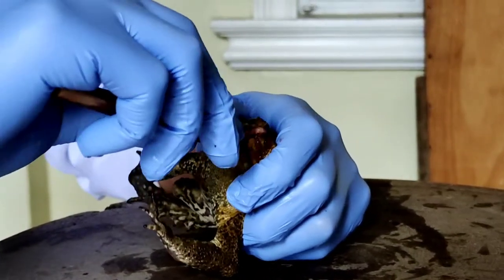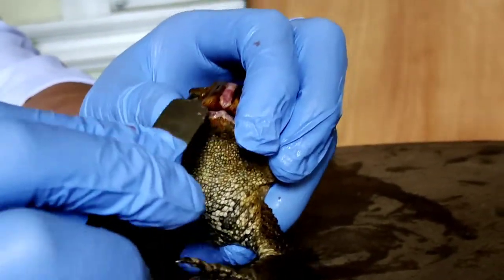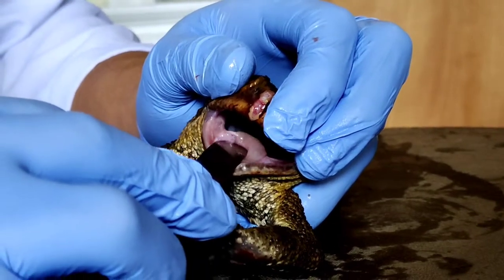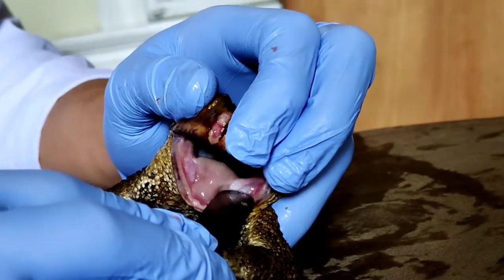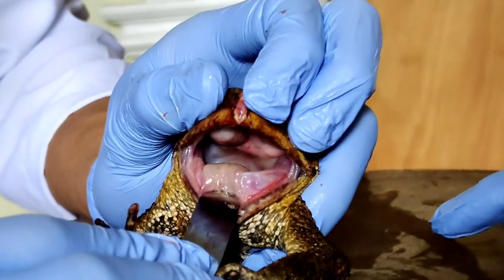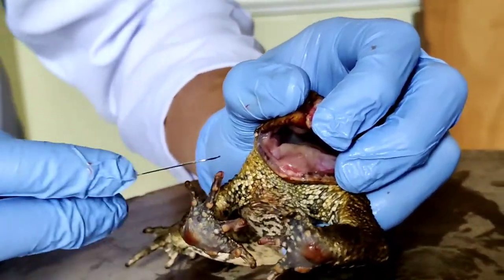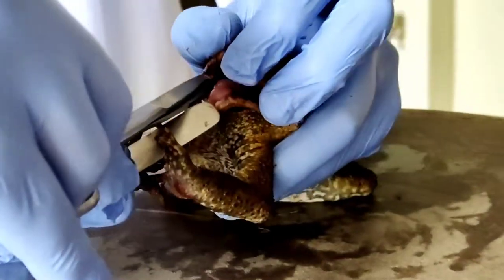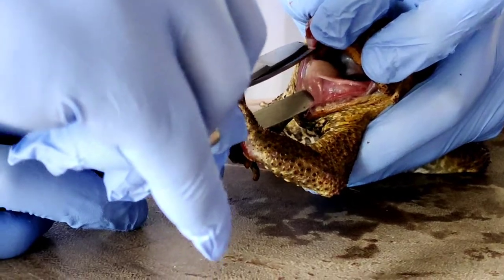We then proceeded to open its mouth to examine what were the components inside. We used scissors to cut the corners of the mouth where the maxilla, or the upper jaw, and the mandible, or the lower jaw, join together.